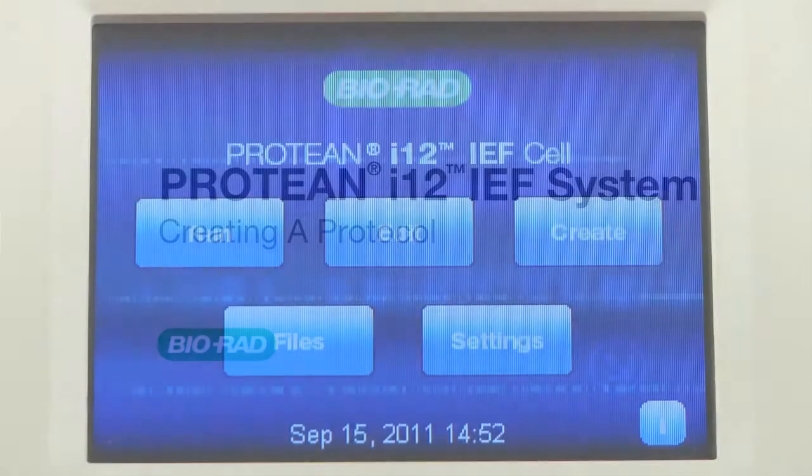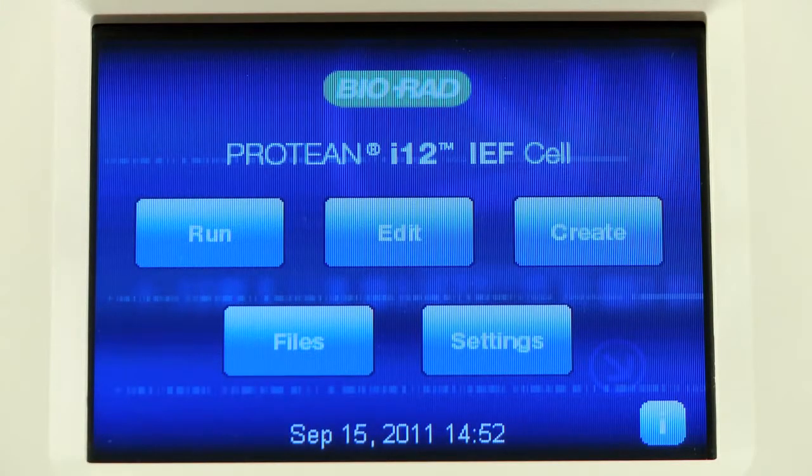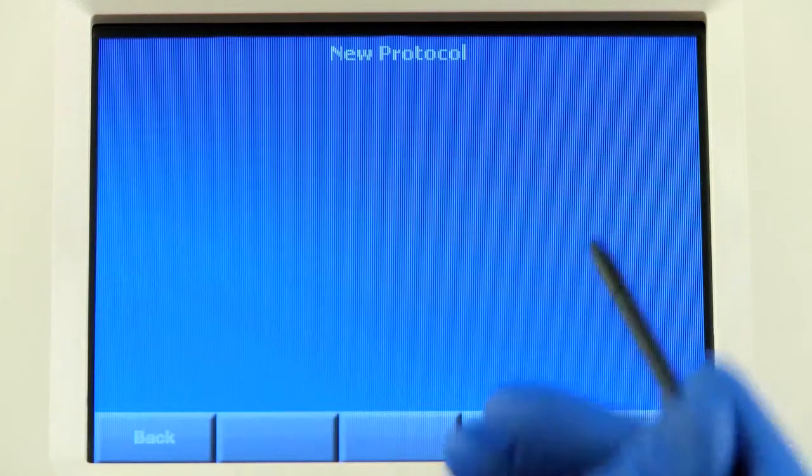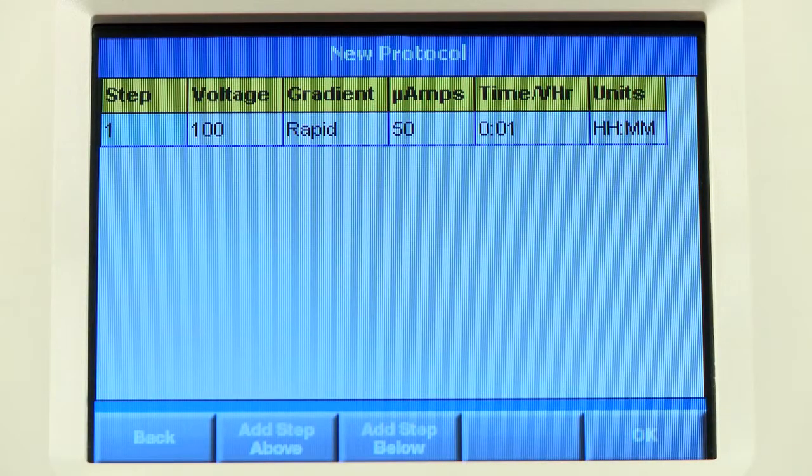To create a new protocol, press the Create button. This will take you to the New Protocol screen.